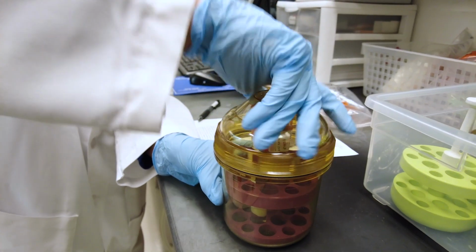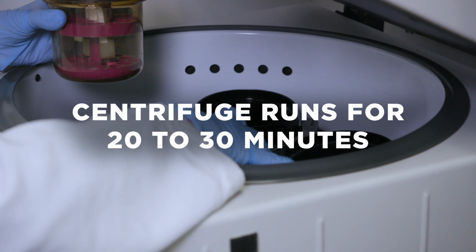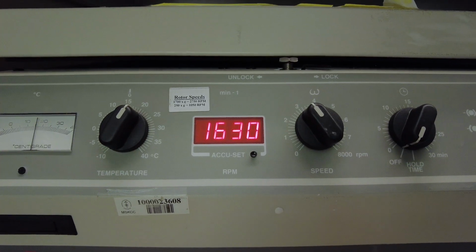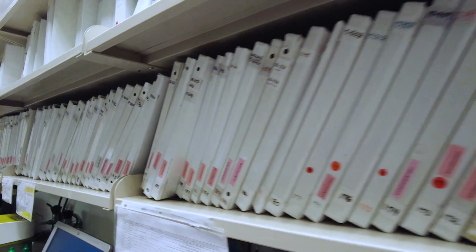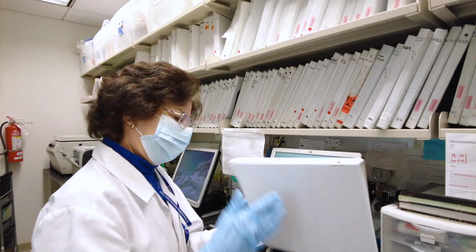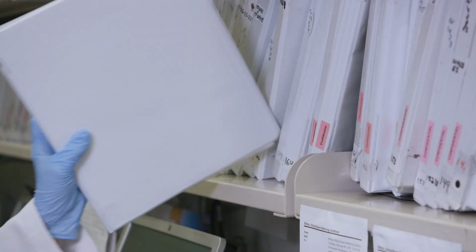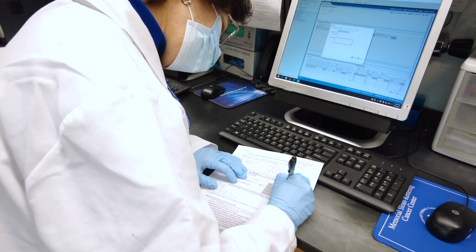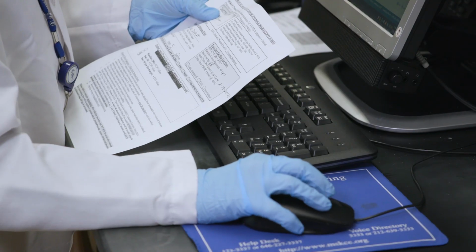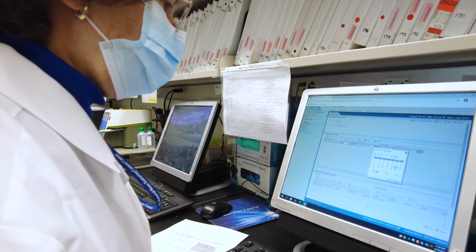While documentation is happening, the samples are run through the centrifuge to separate and remove the red blood cells to isolate the peripheral blood mononuclear cells, or PBMC. The lab member then finds the clinical study binder that is relevant for the study the sample is associated with and notes this is a new addition to that study. The lab member then signs the sample into the CRDB Clinical Research Database, which is an MSK in-house software used for tracking clinical specimens.